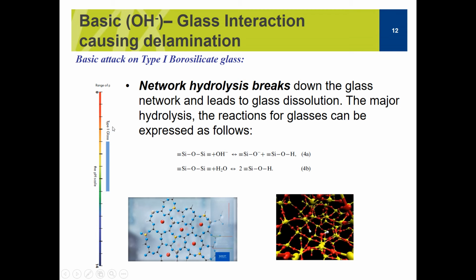So if we take a look at type 1 glass, it protects the formulation really in the middle pH. It's not shown here, but quartz material protects it at lower pH. Okay, and SiO2 coating also protects at low pH. But SiO2 coating and quartz are going to have a hard time protecting the sample at the higher pH, because the OH again goes and attacks this silicon oxygen network.